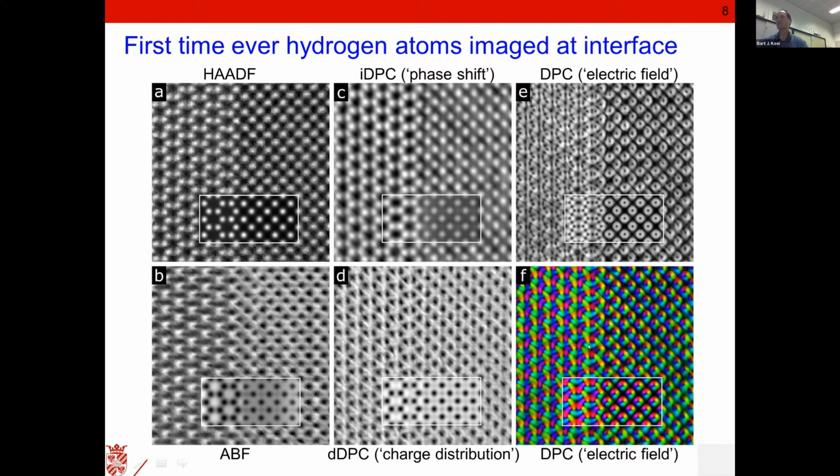And this is a non-magnetic sample, but you can imagine if this would be magnetic, for instance, then this could be connected also, for instance, to skyrmions on a much larger scale, of course, then you can image local magnetic textures in the sample. So this is the power of this technique. But here we really do it at the atomic resolution scale. And also you can very well simulate this, and there is really a very good resemblance between what we simulate and the experimental image. So this all gives you a very good match to what we see.